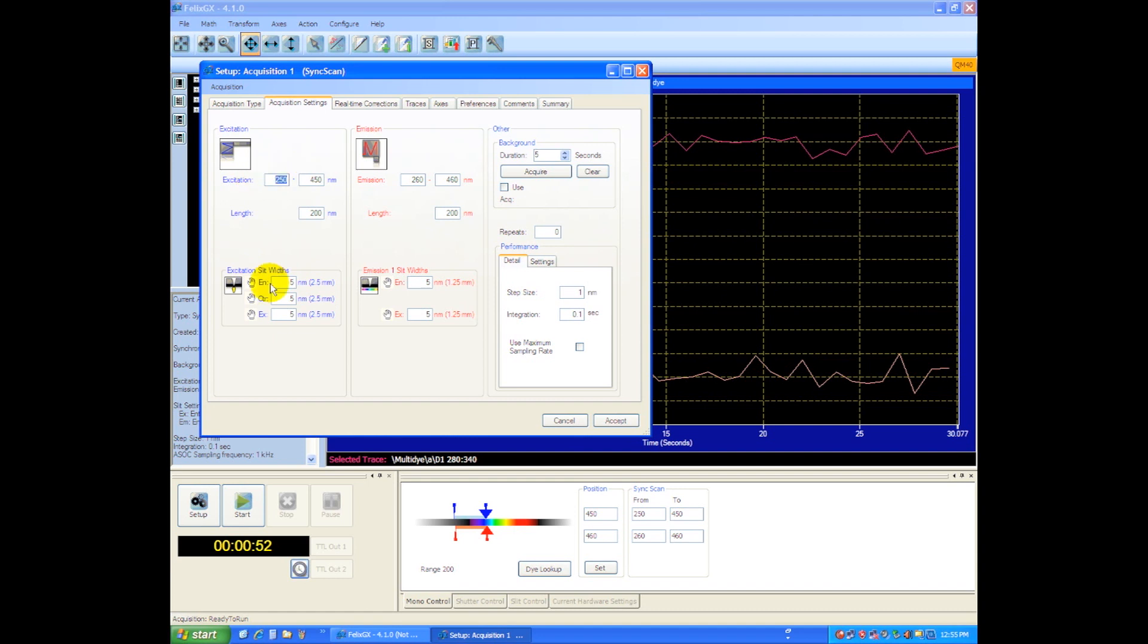So what we'll do here is scan the excitation from 230 to 450 nanometers, and on the emission side we're going to start our scan at 240, so 10 nanometers higher, and we can make it a little bit higher.